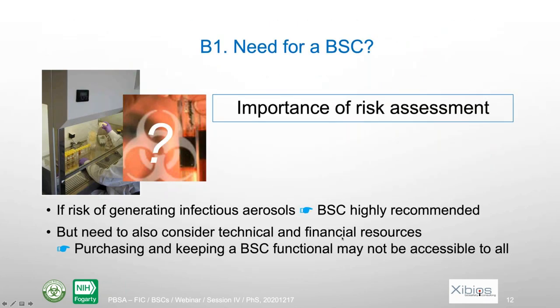But we also need to consider some other aspects, like the technical and financial resources. We need to be sure that we can manage the biosafety cabinet over time, that we can maintain it and recertify it regularly. Given the price of a biosafety cabinet and the cost of maintenance and recertification, purchasing and keeping a biosafety cabinet functional may not be accessible to all. And if you cannot really keep it in a good functioning state, perhaps it's better to look for some other options.